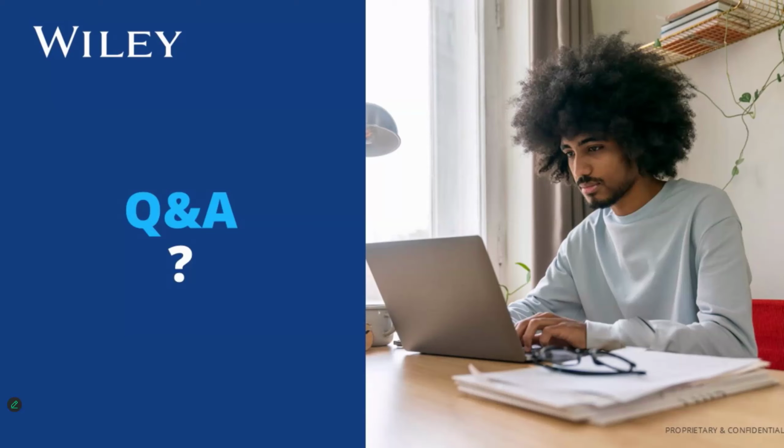For databases, Wiley has the best. I think KnowItAll is the best database building tool. For example, you can put in one spectrum record all the different types of spectra, or the same type but multiple runs. It's very flexible and doesn't limit you on spectrum range and so on. And we're very careful to track data from beginning to end. As soon as data enters our database, we track the changes made to it, so people can have a trail of record of changes made to the original data. So you can export that also.